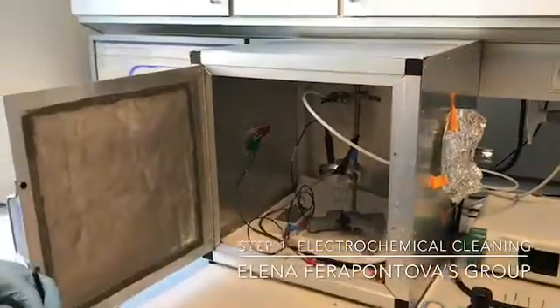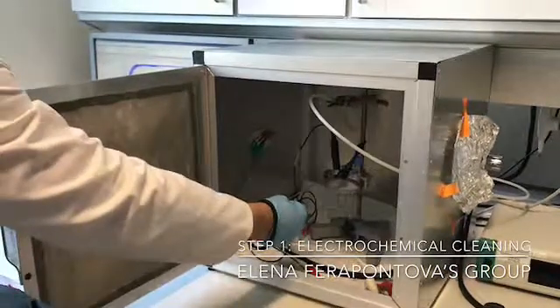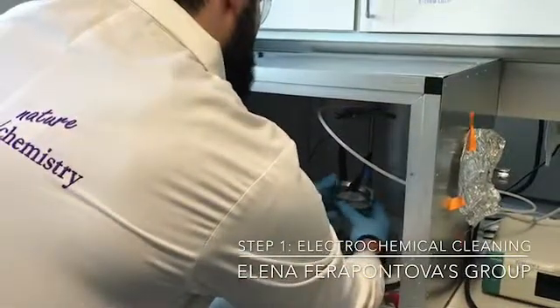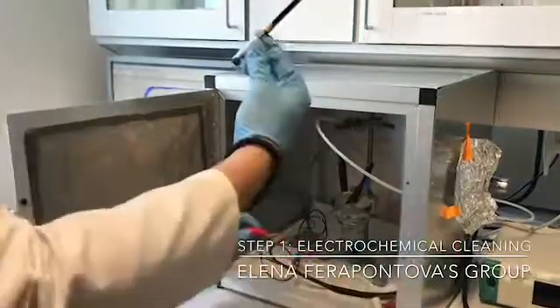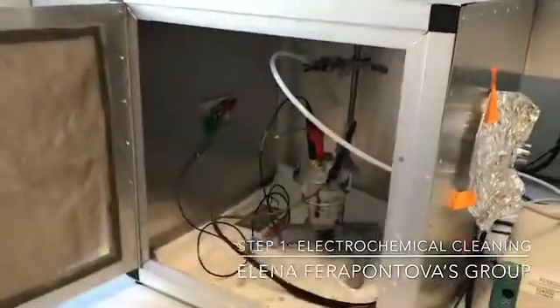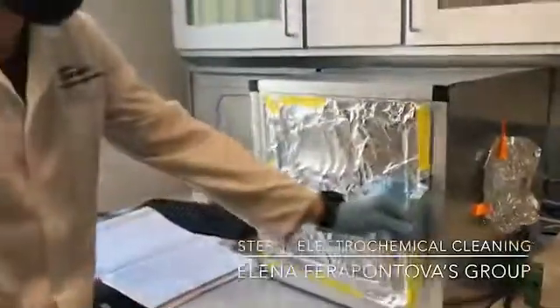I already put the reference electrode and the counter electrode — as you can see they are already connected. You place the cell inside and you close it. Next, you connect the working electrode and then place it inside. Just like this. Make sure you close the door.